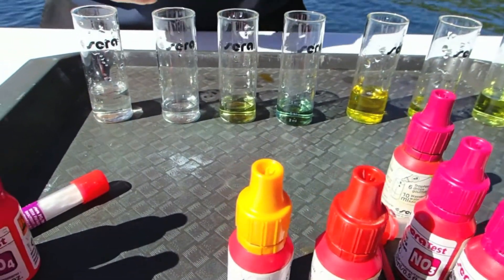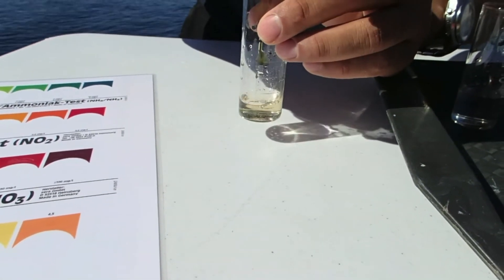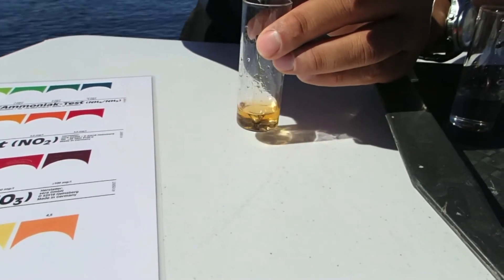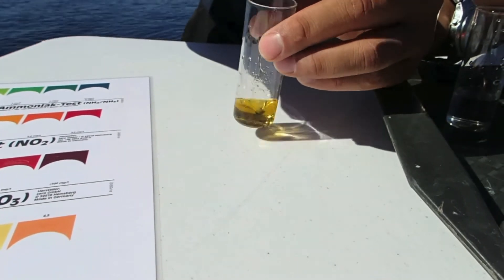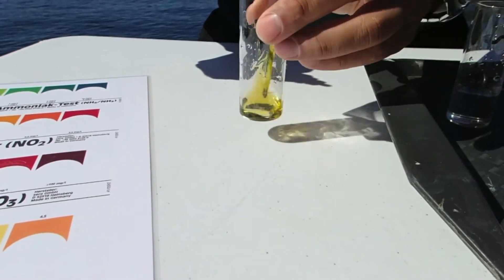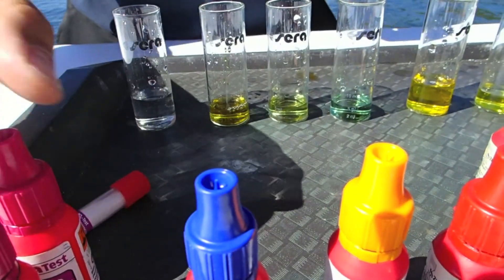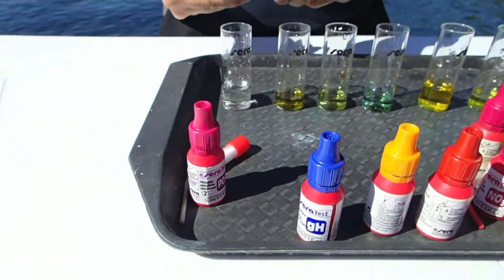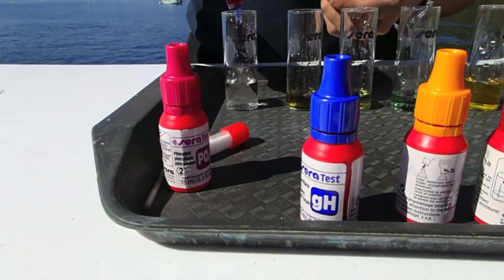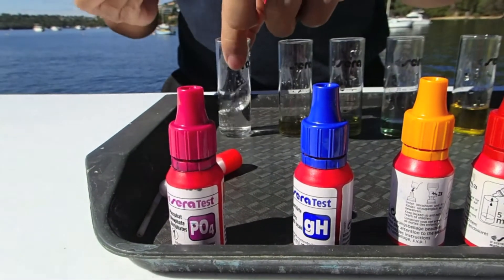And with the general hardness, it's the same thing — it's a titration effect. So you're counting the drops for it to turn back to green. 1, it's a bit orangey there. 2, 3, 4, 5, 6, 7, 8, 9, 10. It's about 10 or 11 for that. So you'll be jotting this down or making a mental note of it. And with the phosphate test, it's the same as the others, just shaking in between.